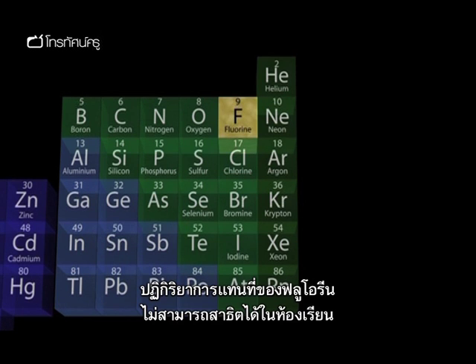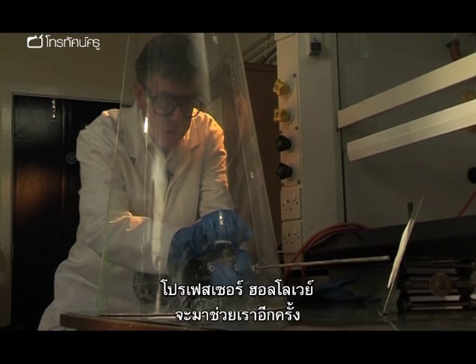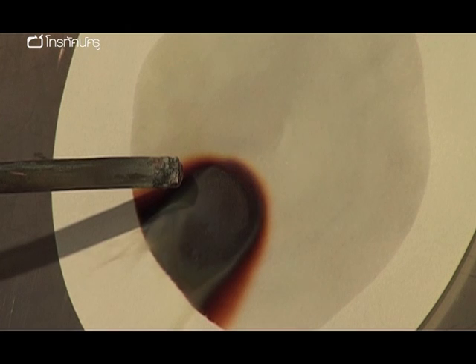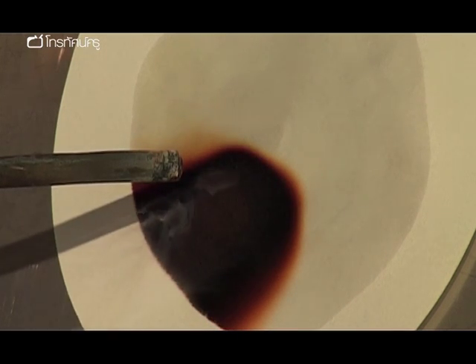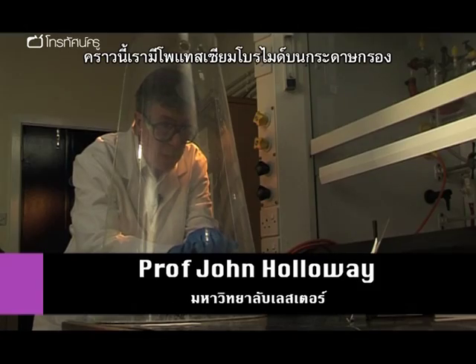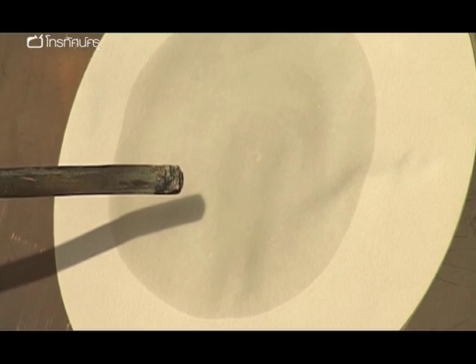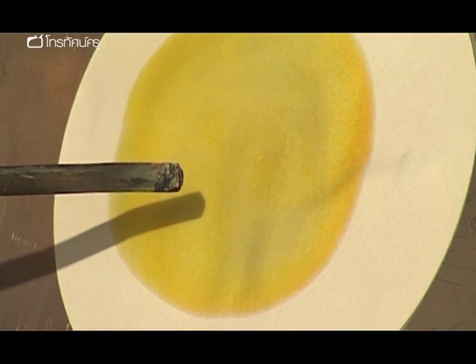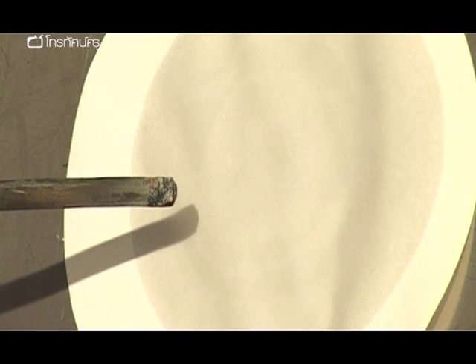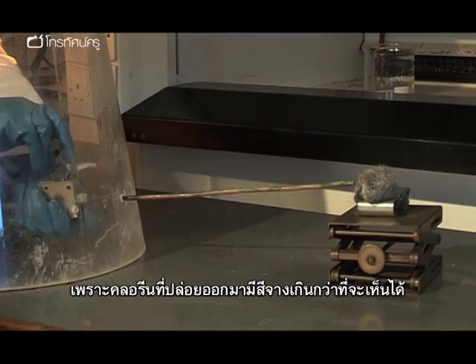Displacement reactions involving fluorine can't be demonstrated in class, so here's Professor Holloway again. On this paper we've got some potassium iodide and we're going to let a little fluorine out onto the surface. And there you can see the iodine displaced. This time we have potassium bromide on the filter paper. This time we have potassium chloride. Nothing appears to happen with potassium chloride because the liberated chlorine is too pale to see.